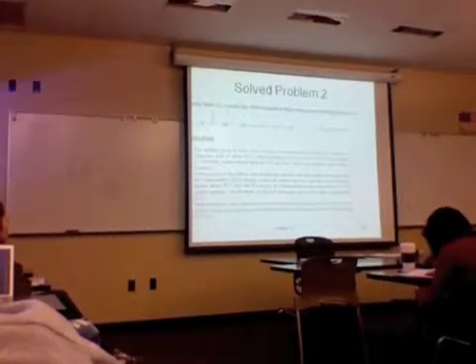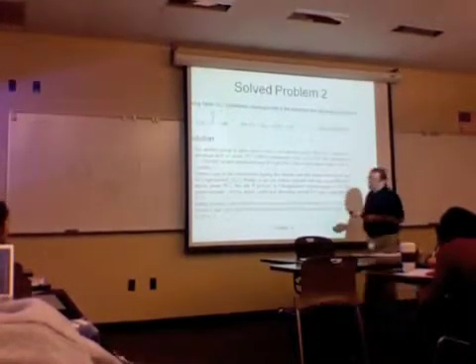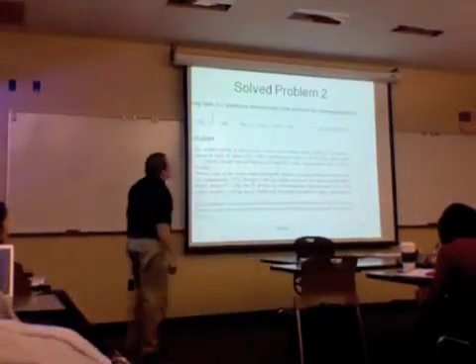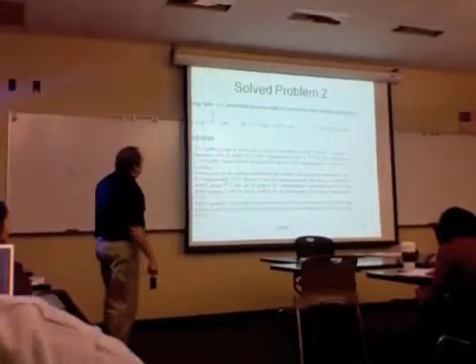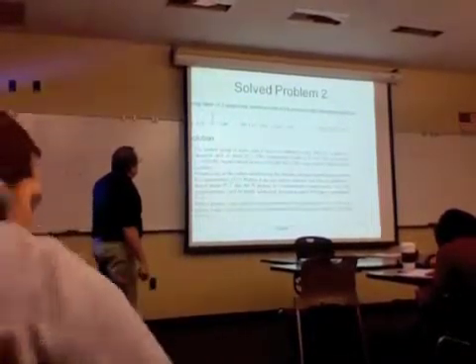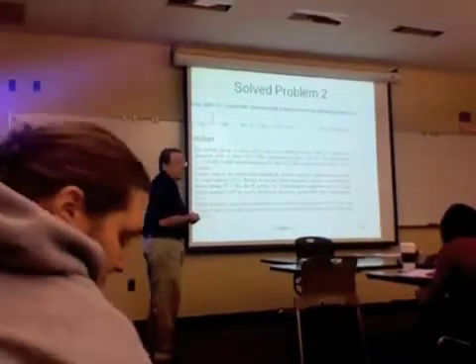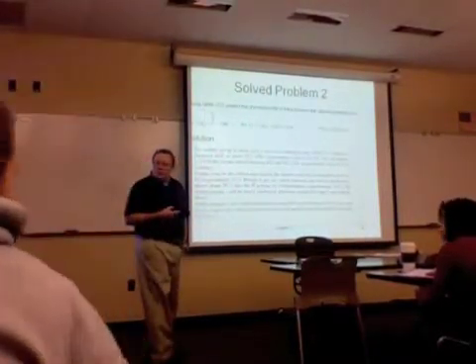All right. Now from table 13.3, which we're not looking at anymore, predict the downfield or chemical shifts of the protons in the following compounds. And let's just do it qualitatively here. Where do we expect this guy to appear? 11 or 12 in that range.